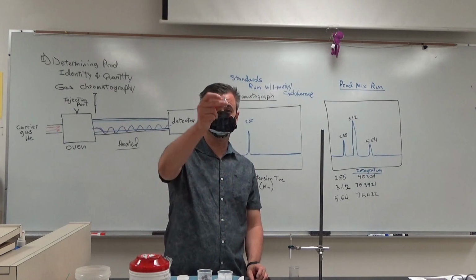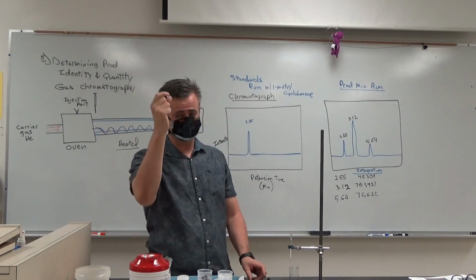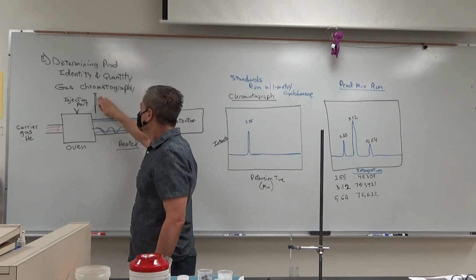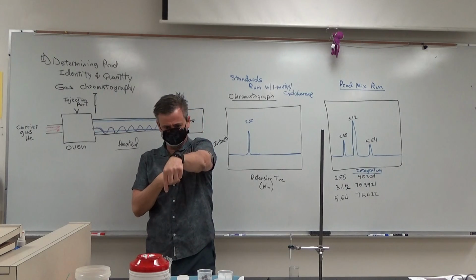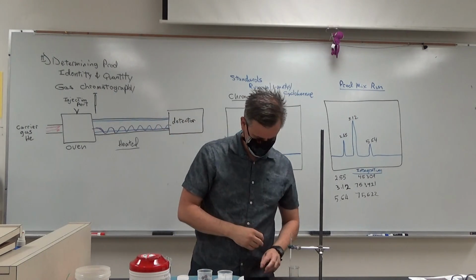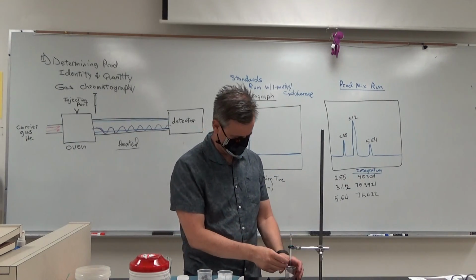You get one of these small little vials, these special vials that go into the GCMS. I should have mentioned, you don't get to do this part. A robot is going to do it. A little arm is going to go. I'm just so excited. It doesn't make the cool noises that I make.